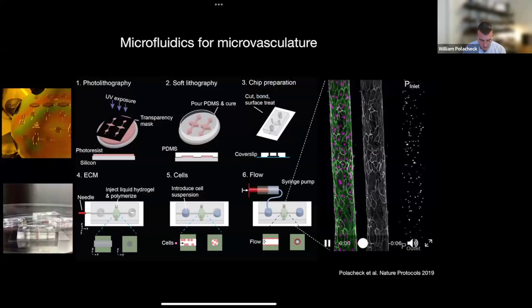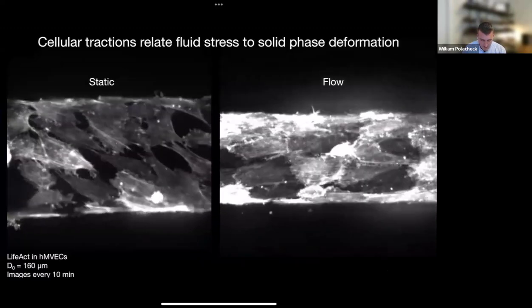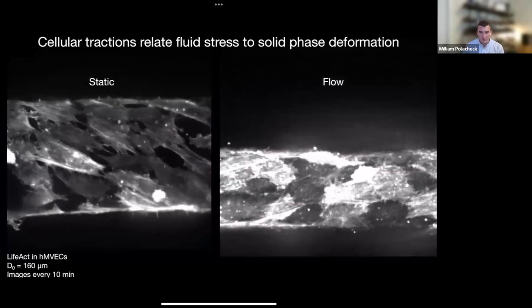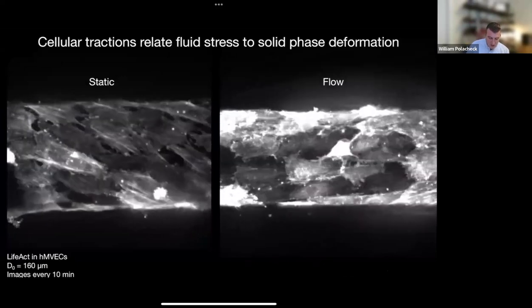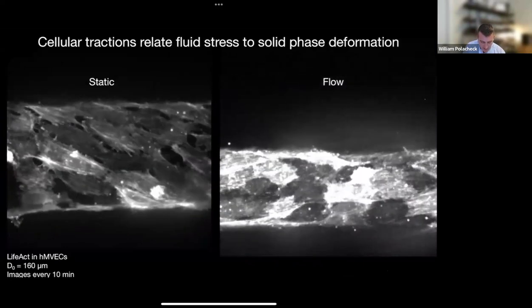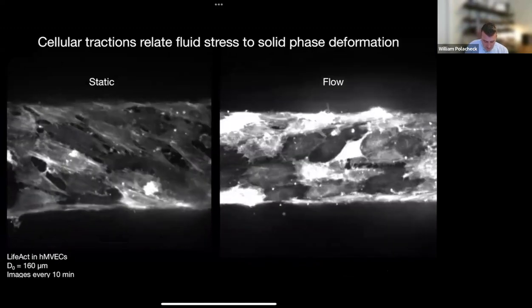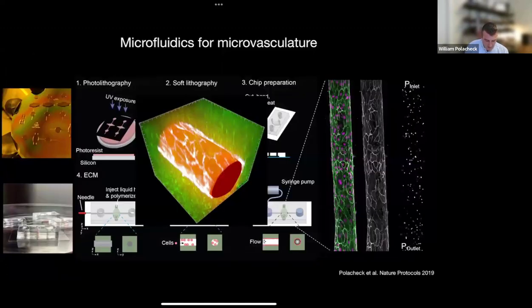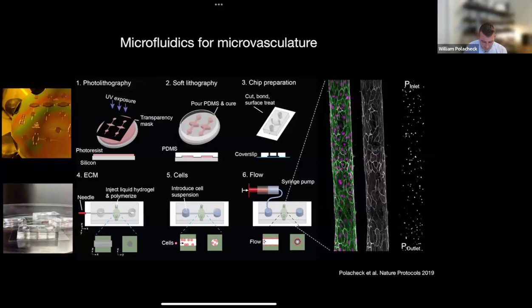All right, so I'm going to skip over some stuff here just to show that this was just an example. This is a tube of endothelial cells, which is a core assay that our lab uses. I will go back one slide to show the basis for this. One of the devices our lab uses these days is where we make these tubes of endothelial cells that we can then perfuse with pressure and flow.